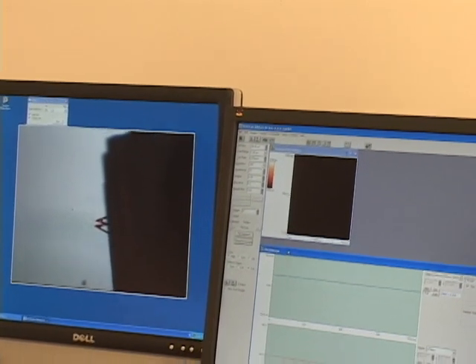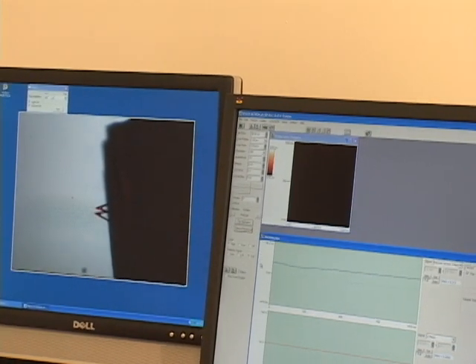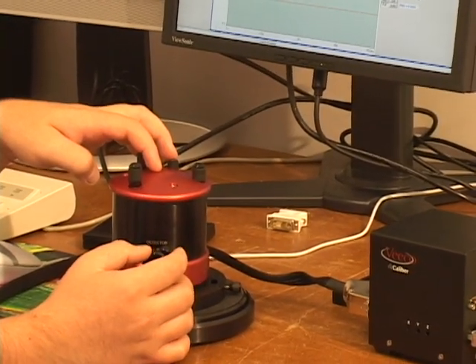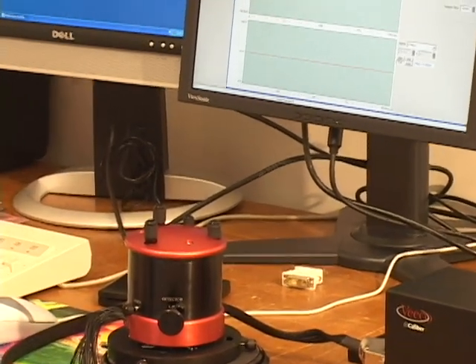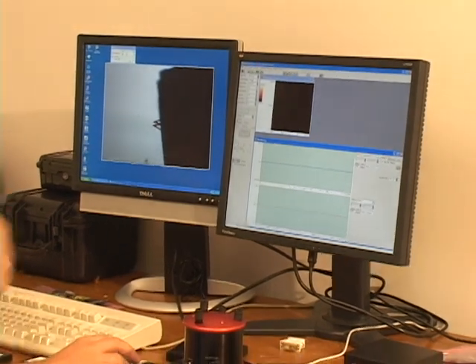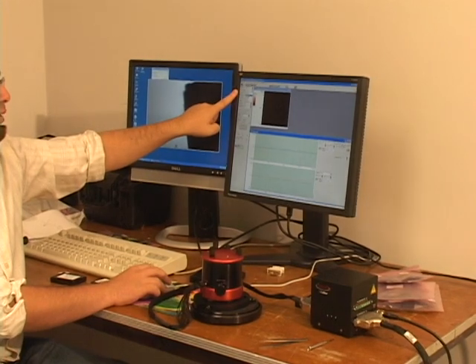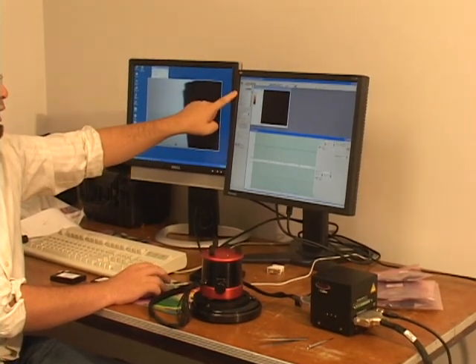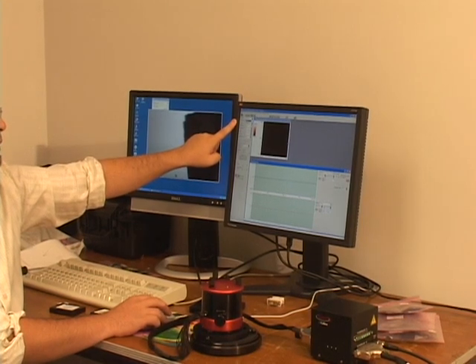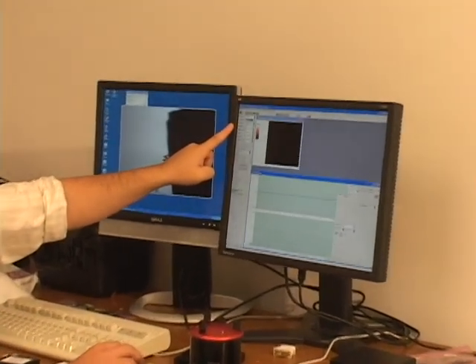And then it looks like lowering actually affected the laser alignment. So we go back into the top bottom signal and bring that one back down to 0. So we're moving down to 0. We have 30 nanoamps as our set point. Scan range right now is 1 micron. We'll do a 50 micron scan size. And scan rate could be between 3 and 4 times the scan range. So 3 times 50, 150 microns per second. It can handle up to 200 microns per second.